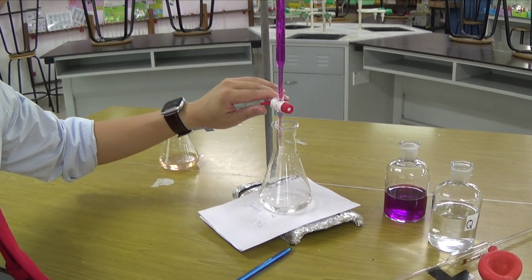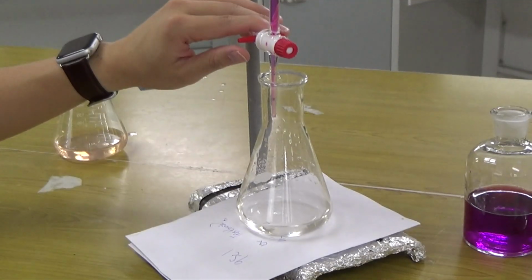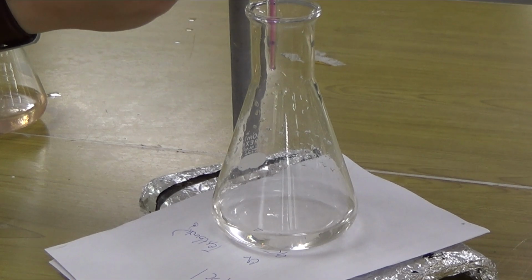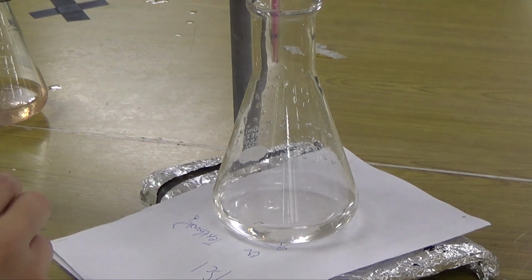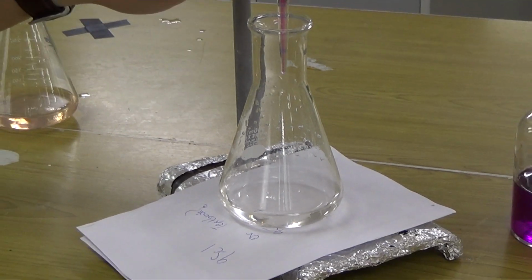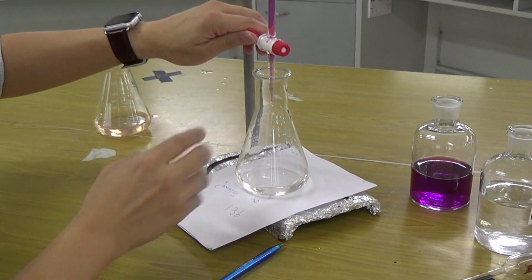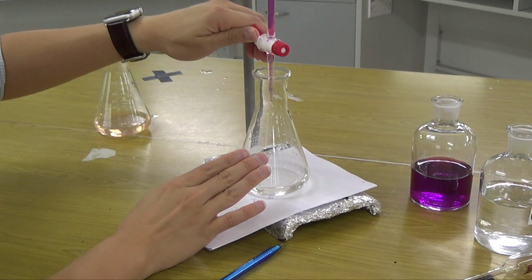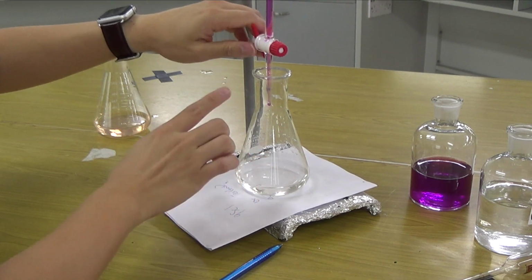So let's focus on that. Let me just zoom in on that. So I'll just do drop by drop now. So let's just focus on getting this thing drop by drop first. So you want your hands, you're around 2 cm away. So spend some time getting the control right. So I already got it drop by drop.